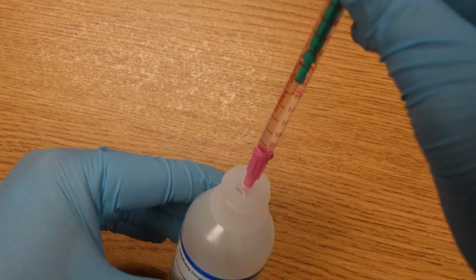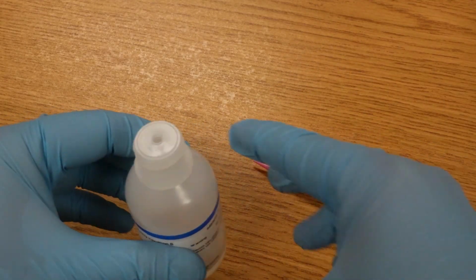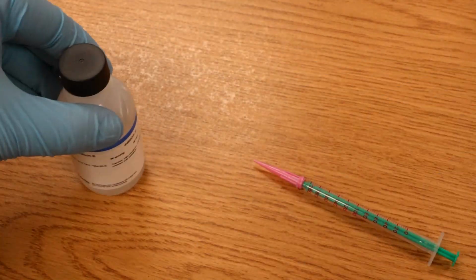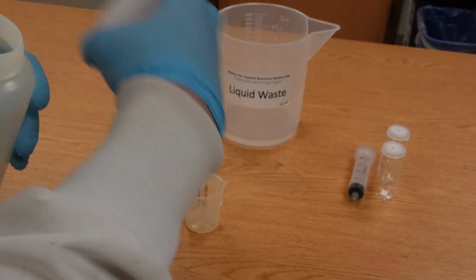Empty any remaining reagent B in the titrator back into the reagent B bottle. You've just completed your first replicate. Now, it is time to repeat this process for the second titration vial. Use the sample syringe to draw up sample water, making sure to invert the sample bottle 3 times.